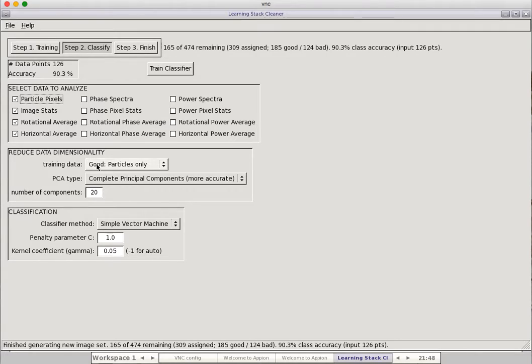I forget how this gets updated. Yeah, so there it was. I just added 1,600 pixels because I added that. It's kind of a slow update. Image stats is where it gives the mean, the median, the skew, the kurtosis, the standard deviation. Basically it's collecting a whole bunch of statistics on the image and it passes that out, so you can kind of classify things.